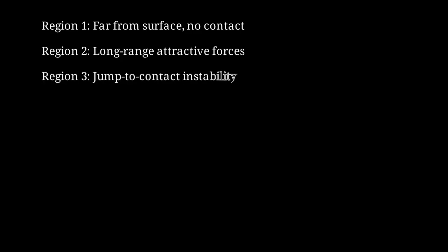Region 3. If the force gradient exceeds the cantilever spring constant, we get a mechanical instability called jump to contact. The tip suddenly snaps onto the surface. This happens when the derivative of force with respect to distance exceeds k. Mathematically, dF/dz greater than k leads to instability. This is a critical concept in AFM.